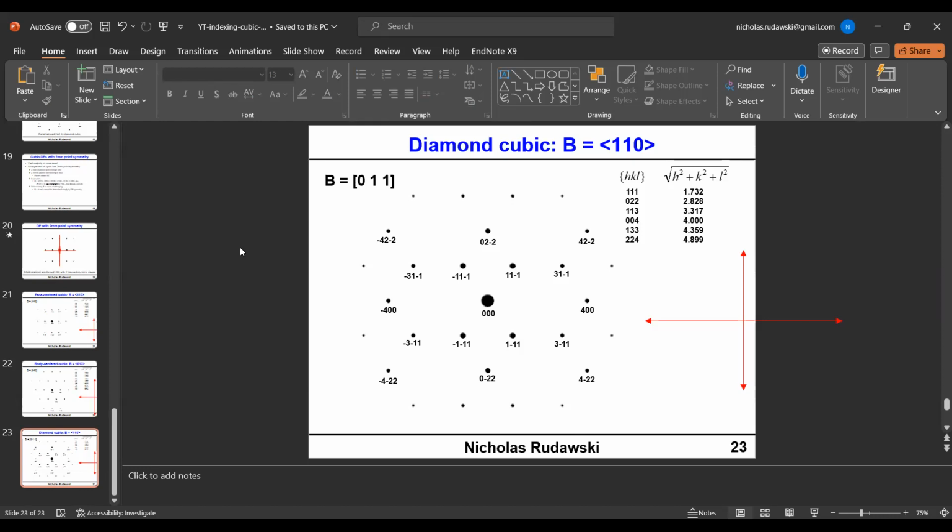So now if I get ambitious, I may do one for hexagonal. Okay, so if your material is hexagonal close packed or has an A to C ratio that is close to the ideal hexagonal close pack ratio, you can also do that in a manner that is similar to how we do the cubic ones, although to be sure, it is definitely more involved. Okay, so that might be another video. But I know there was a lot of interest in a video about indexing diffraction patterns and figuring out the zone axis. So long time coming, but we finally got it done.